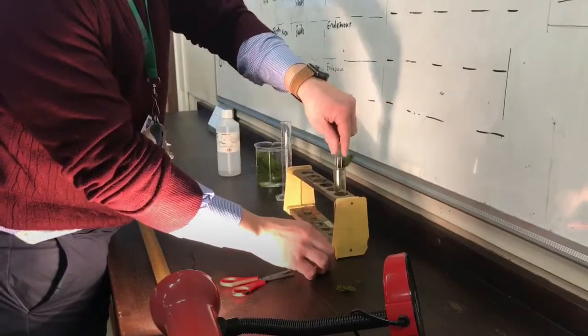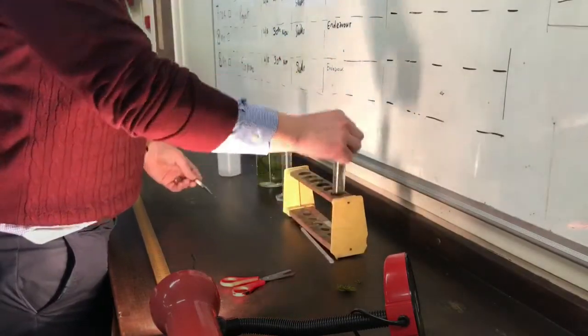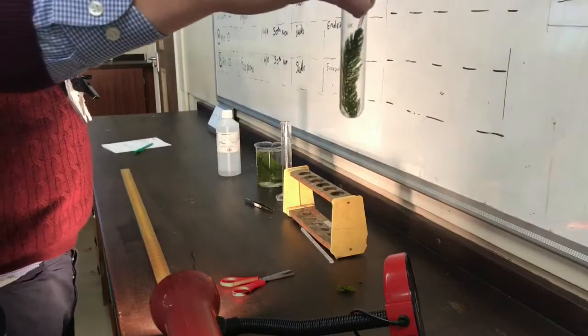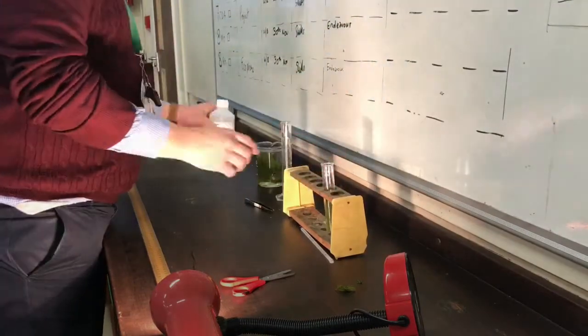This will then go in the test tube. Actually put it in the wrong way around. You should put the snipped end upwards so you can see the bubbles clearly.